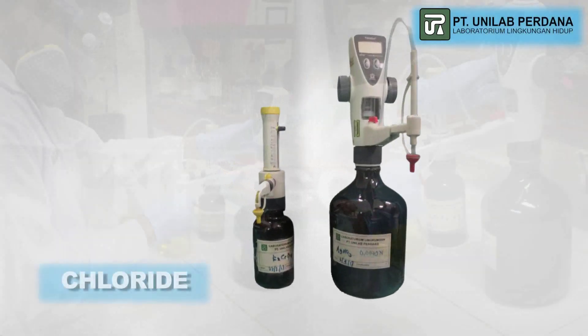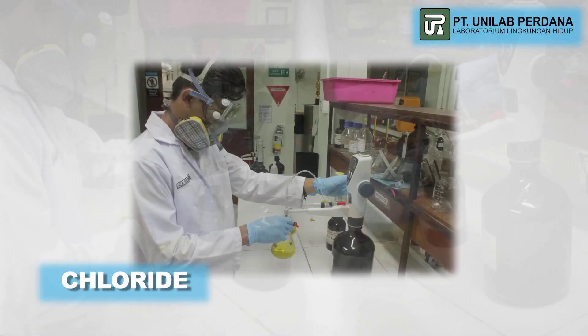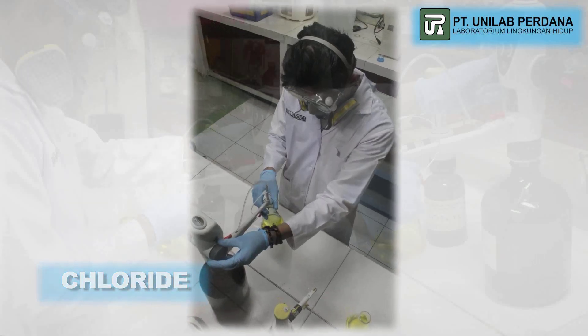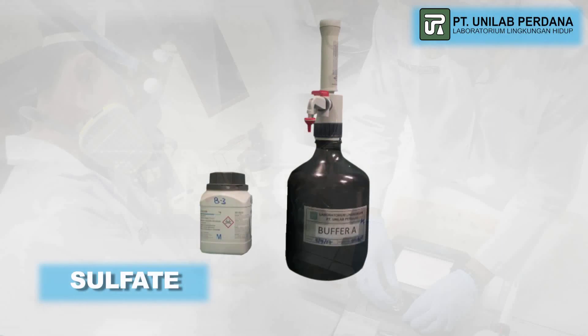The procedure for determining chloride content in a water sample is by the titrimetric method. A high level of chloride can cause damage to water pipes.